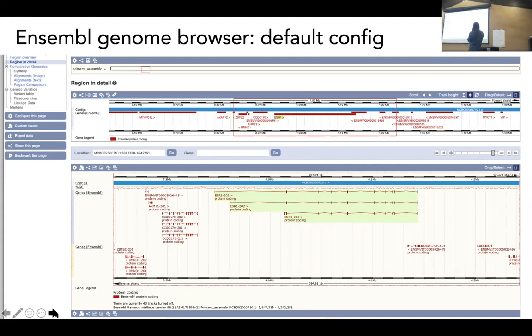And up here is the entire scaffold. So each of these red windows is zoomed in to the next level. So this red window is what you're looking at down here. And there are all these tracks. Essentially these are all the models in this part of the genome. We're interested in these 3, which are all the estrogen receptor.